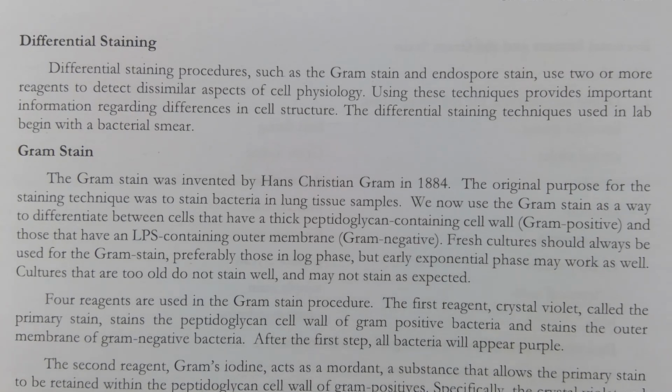Alright, this video is for Biology 234, and we're going to be discussing simple and gram stain. So first we'll discuss differential staining.